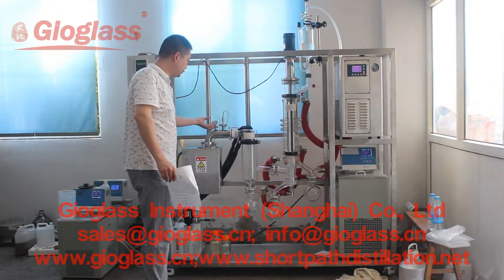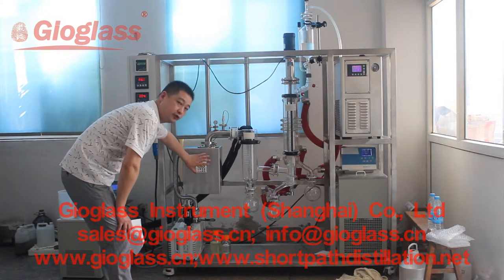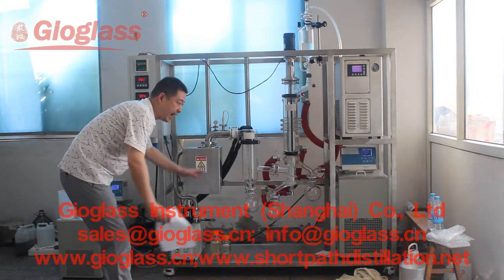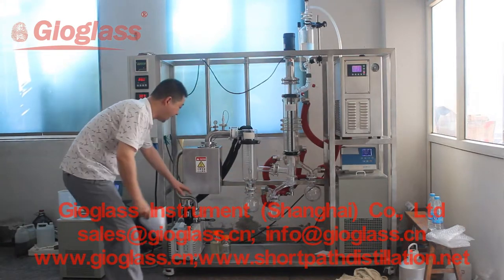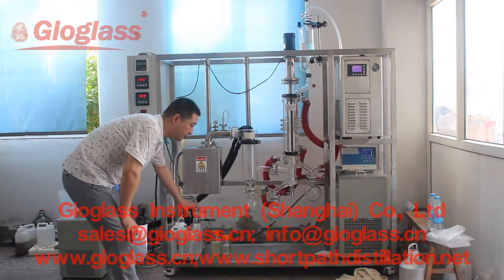This is the vacuum valve to adjust the vacuum degree. This is the diffusion pump, which raises the vacuum degree so we can get a lower vacuum here. And this is the oil pump.